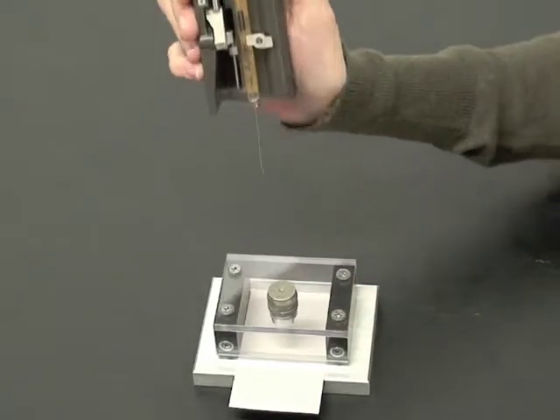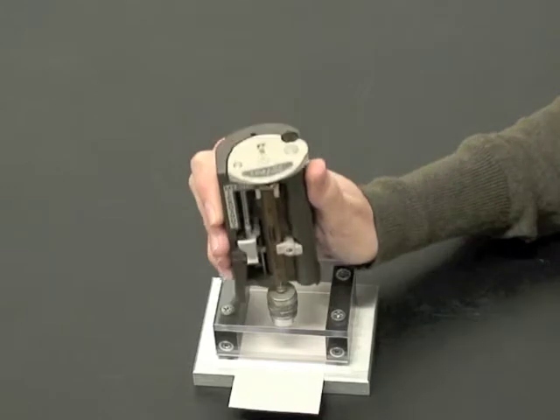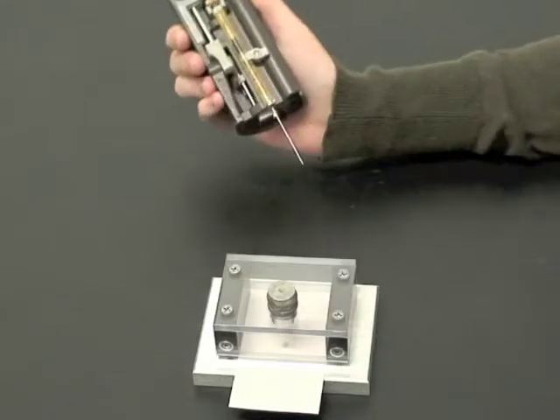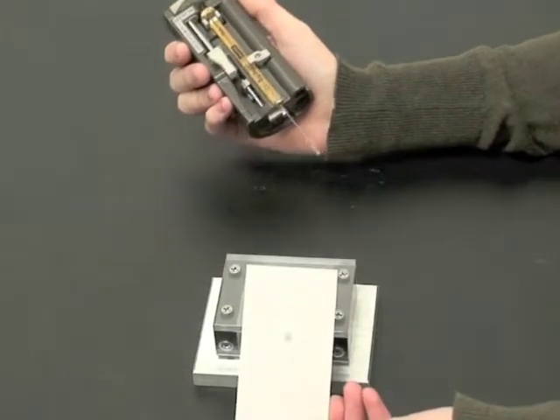Sample injection into an injection port is one simple motion. You can see the drop of sample, which is ejected from the needle into the injection port liner.